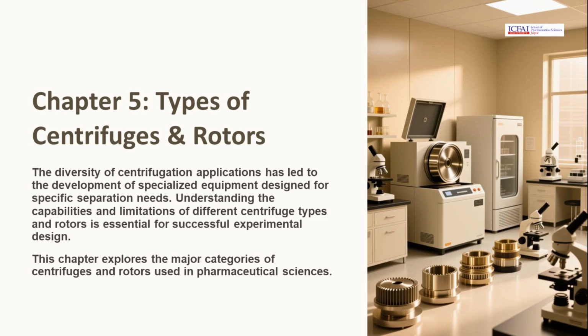The diversity of centrifugation applications has led to the development of specialized equipment designed for specific separation needs. Understanding the capabilities and limitations of different centrifuge types and rotors is essential for successful experimental design. This chapter explores the major categories of centrifuges and rotors used in pharmaceutical sciences.